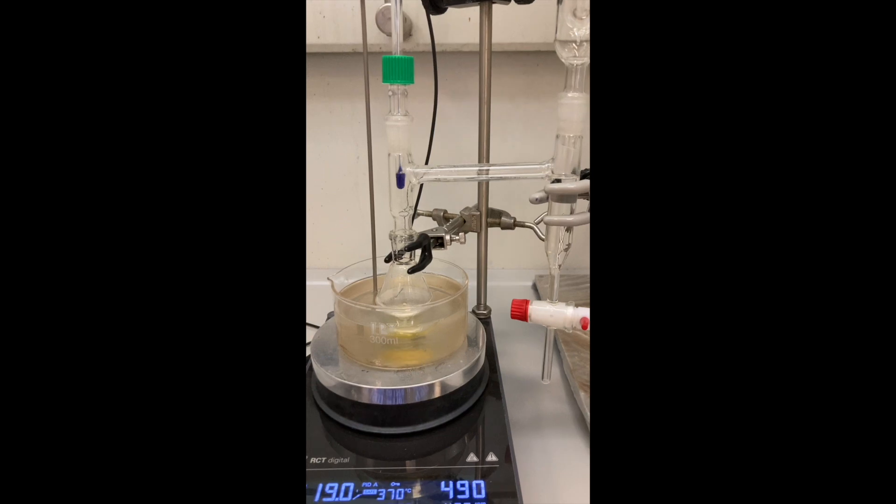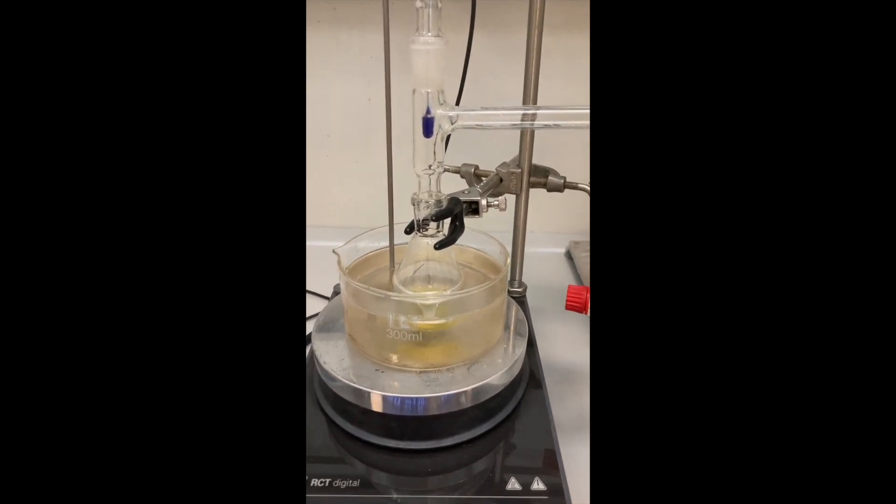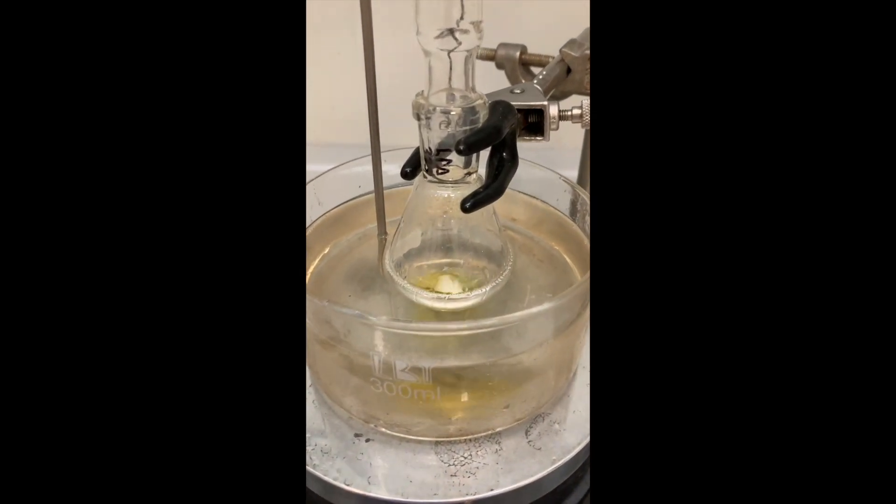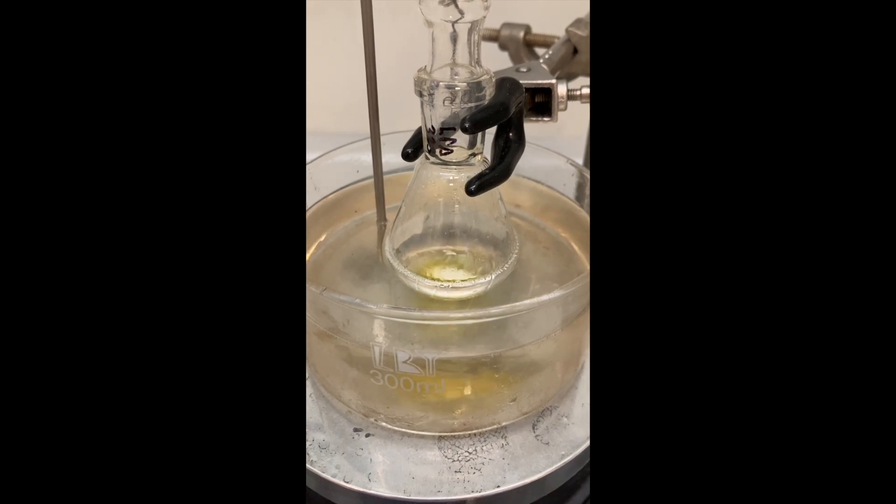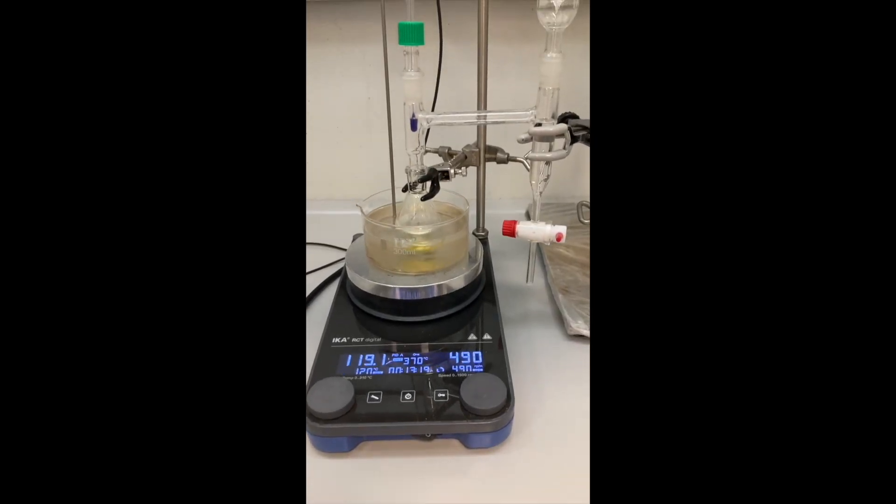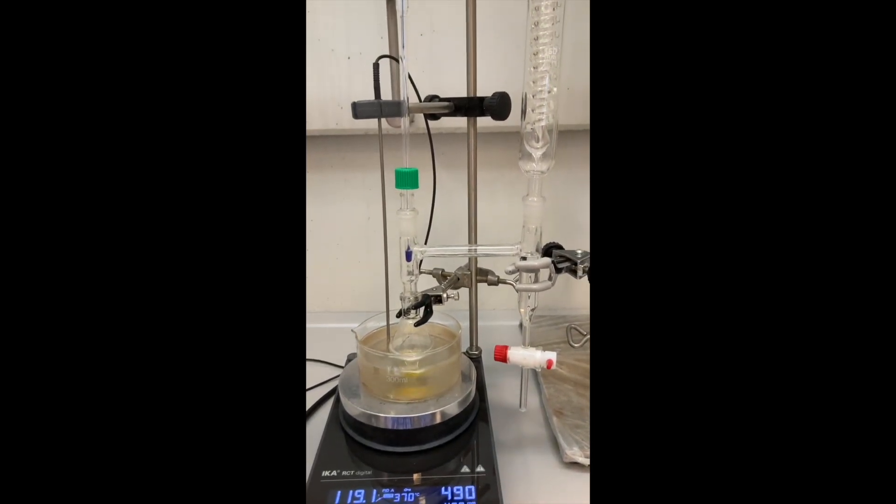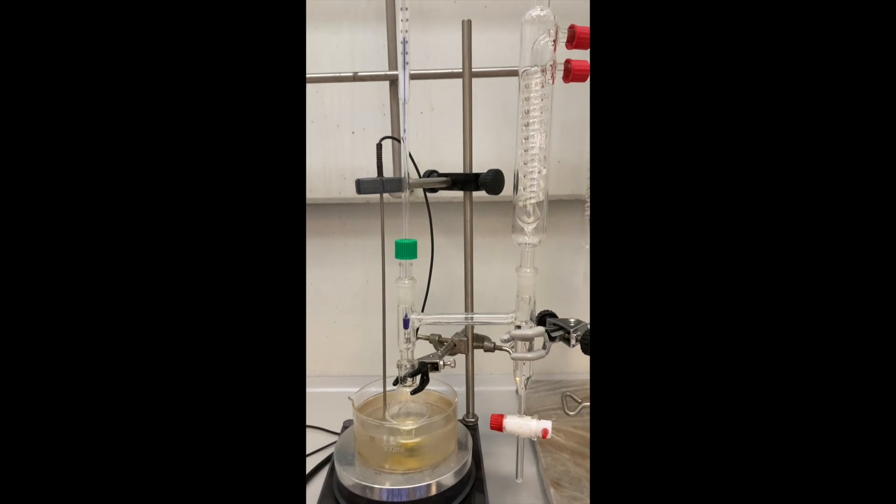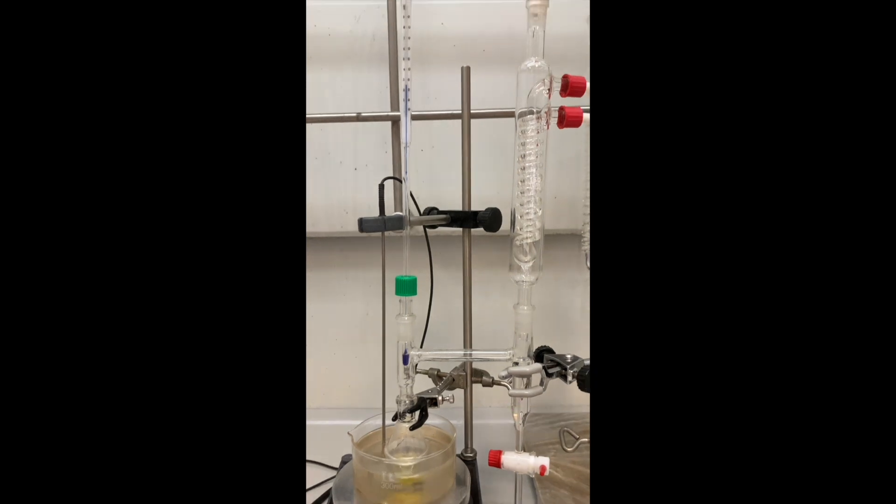Toluene and water are immiscible liquids. However, they combine to make an azeotropic mixture that distills out of the reaction at around 84°C. This vapor travels up into the condenser where it cools down and drips into the distilling trap. Here, the immiscible liquids separate.